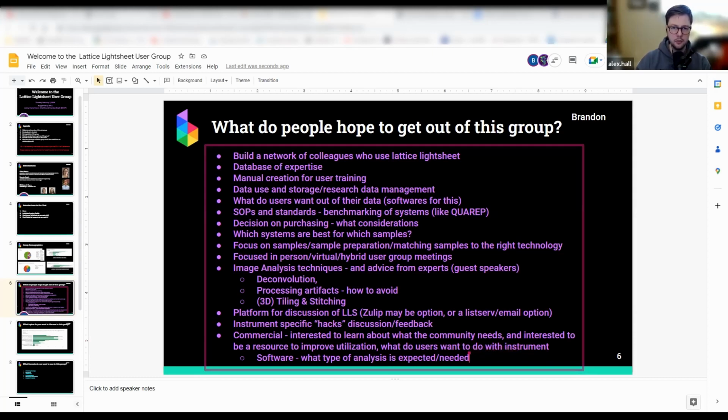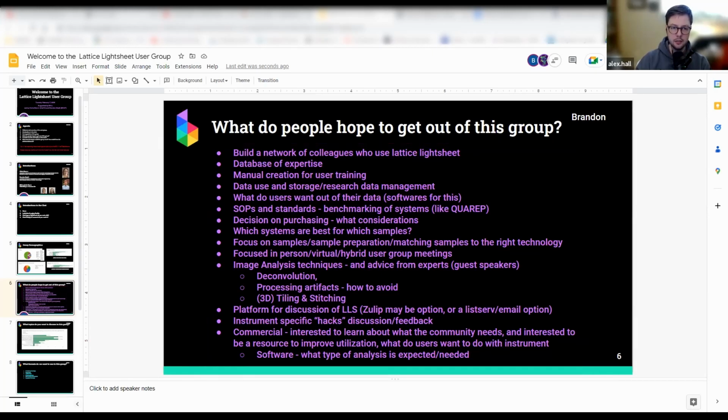But what I'm noticing is the end users are expecting a lot of the convenience and ease of use of data loaded in memory from these large lattice light sheet data. In a perfect world, it would just work, but it's not so simple. So we have to take note in the commercial world of what are the most common needs and requests, and can we make smart compromises to accommodate a large bulk of the users as best as possible. So that's what I'm listening for.